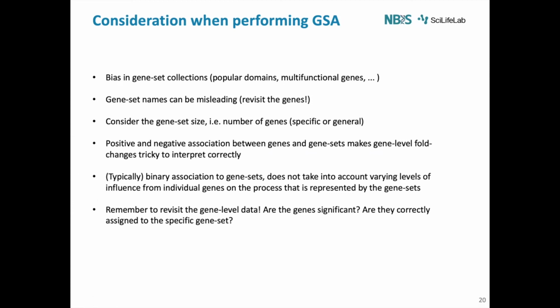So we might find some results that are actually not that meaningful or significant. So in some cases, always check that you have a gene that you can validate, or do a qPCR, for example. Yes.